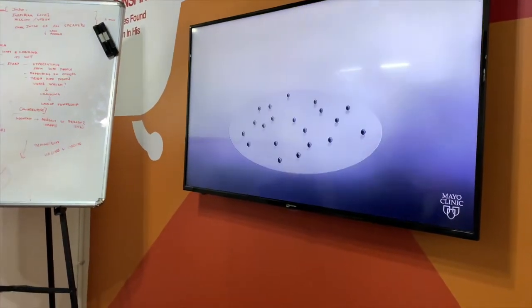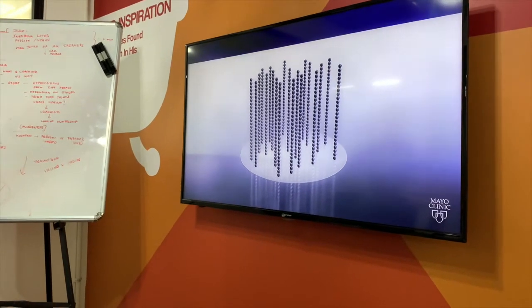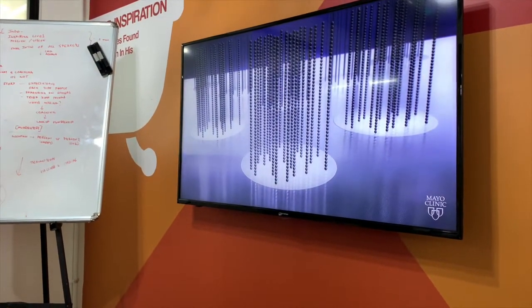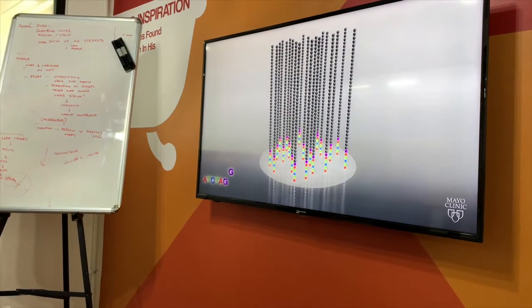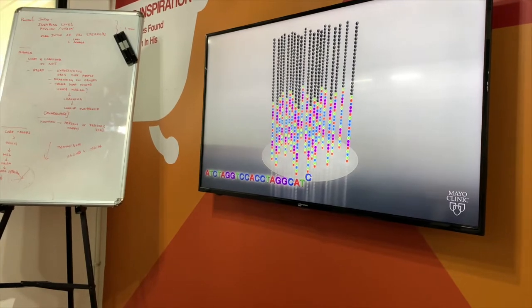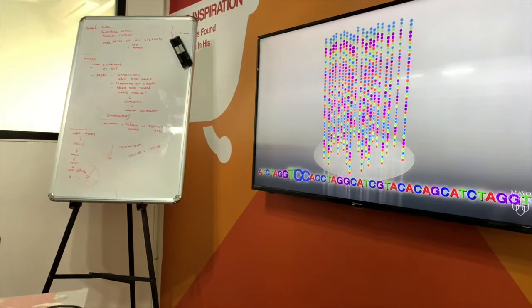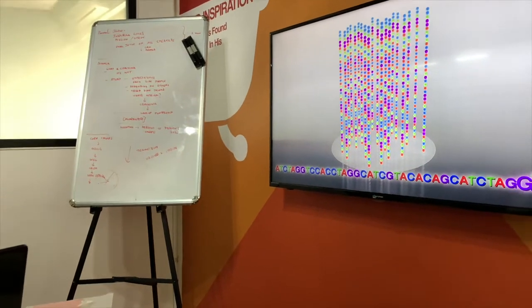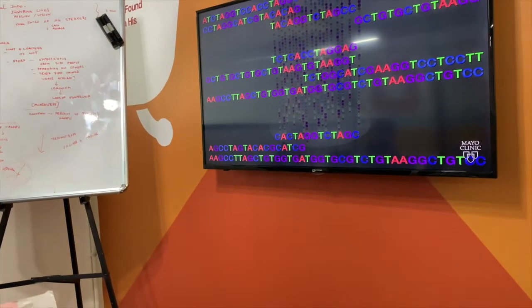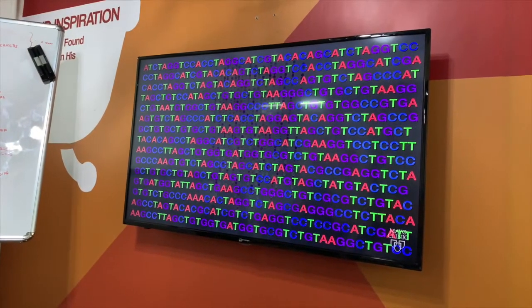In a sequencer, each piece of DNA is copied hundreds of thousands of times, which creates clusters of identical DNA fragments. Next, the sequencer reads the DNA, one base at a time, using different colored tags for each DNA base. This sequence of colors reveals the DNA sequence of each fragment. Powerful computers piece together these individual DNA fragments and reveal the sequence of your DNA.